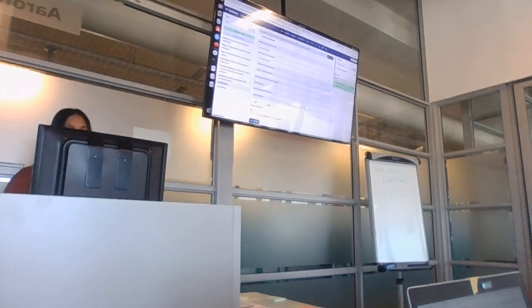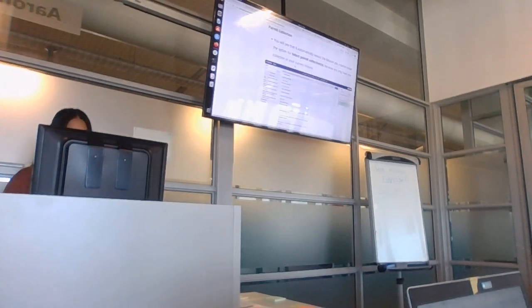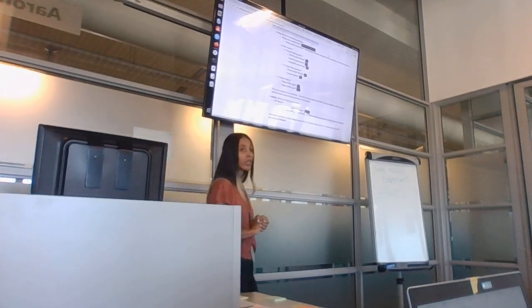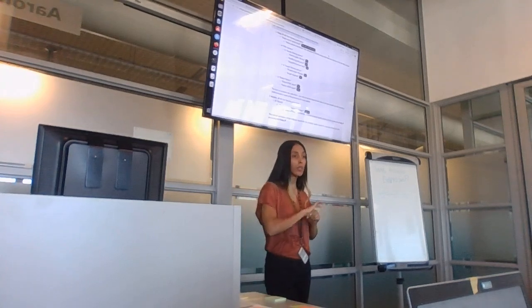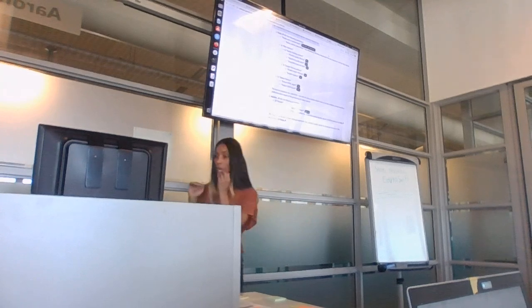Okay, now follow the tutorial. It's under workflows on the website. On this pathogen genomics website, it will tell you here which parameters you need to add. Now we're not just going to run the tool on its own, we are going to add specific parameters to FastP. So add these parameters.